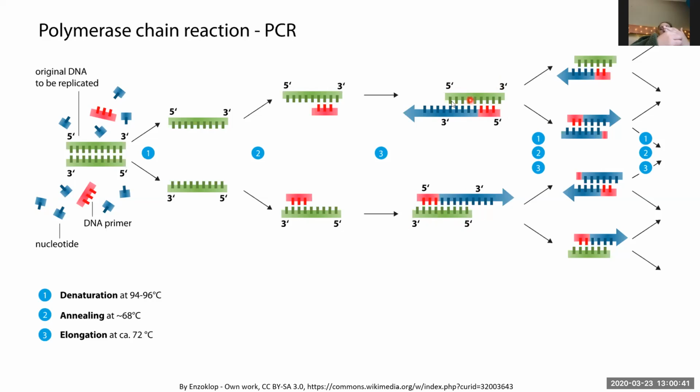So when you split it apart, we have a primer here to amplify the section. It's just going to be the opposite strand. No, it's a good question because you have to kind of think about it. We could just amplify off of this strand, but we would not amplify everything logarithmically or exponentially like we want to if we didn't have it. Okay, good questions.